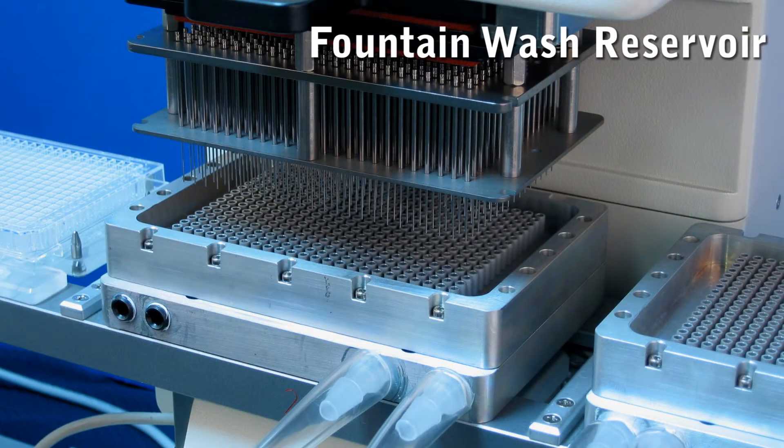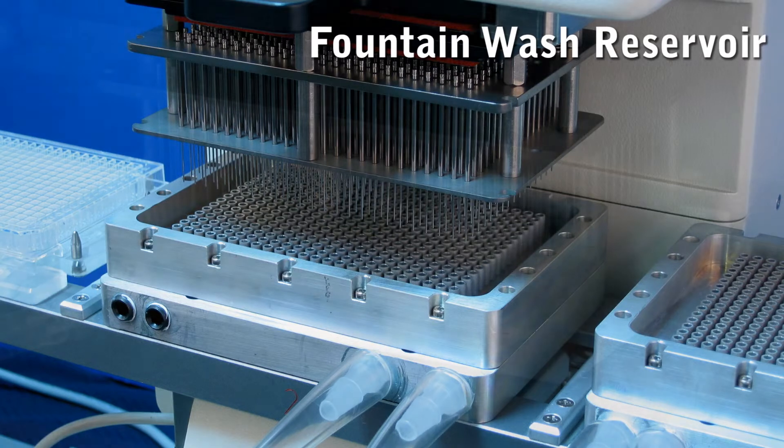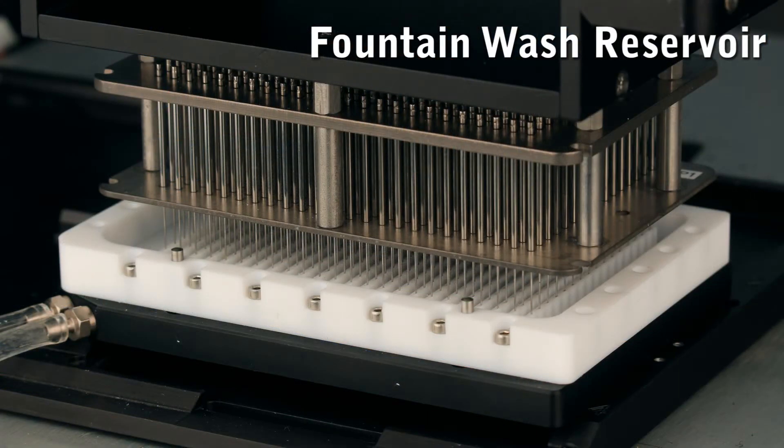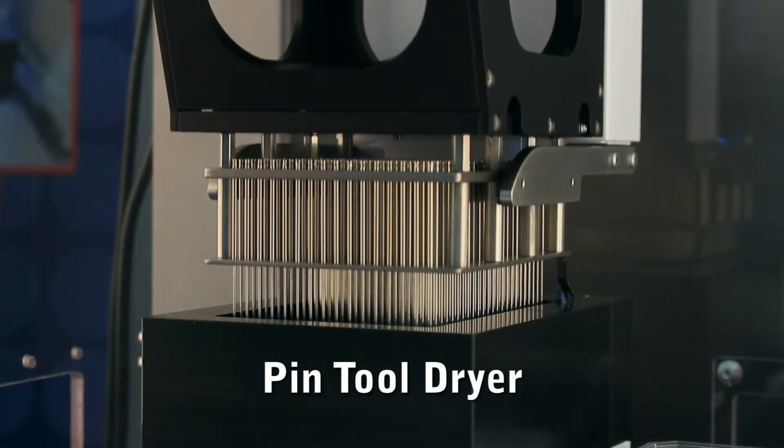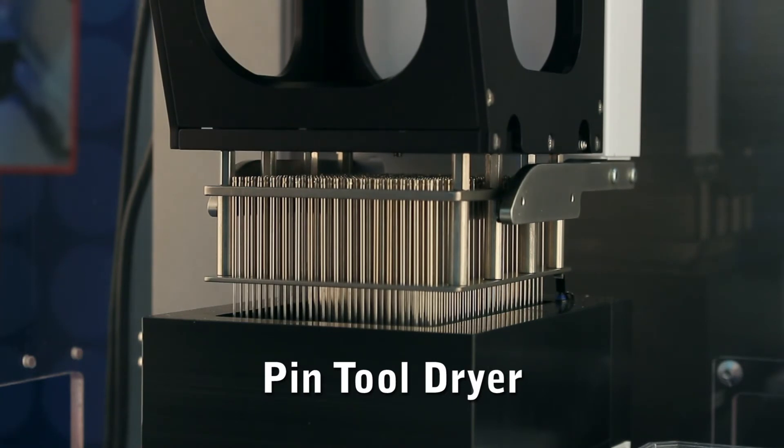Our fountain wash reservoirs allow for your wash agent to flow through the chimneys. This separates each pin from contaminating another pin. After the last alcohol wash, you can use our pin tool dryer to dry off the pins before starting your next transfer.